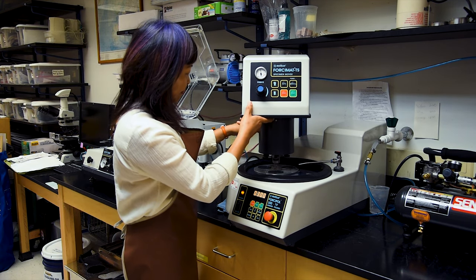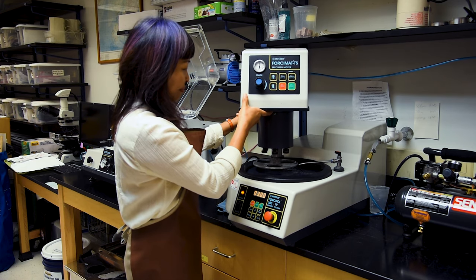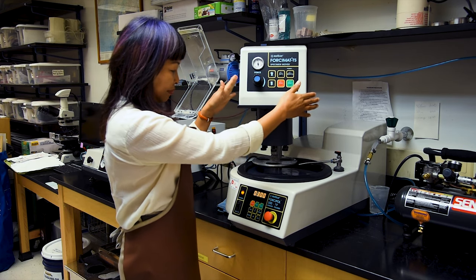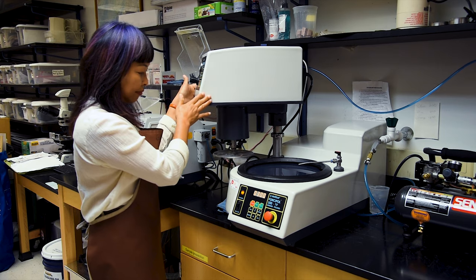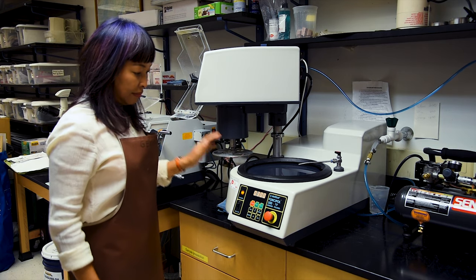The ForzaMat is an automatic specimen mover used to hold multiple sample chips for polishing. However, we won't be using the ForzaMat, but if you have this type of equipment, you may want to try using it.